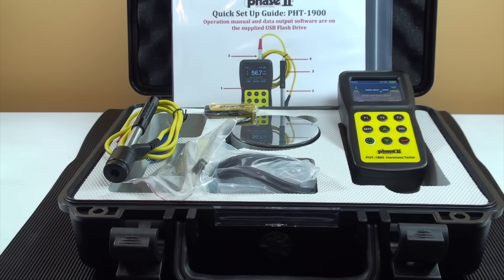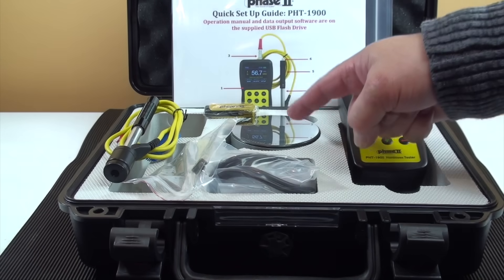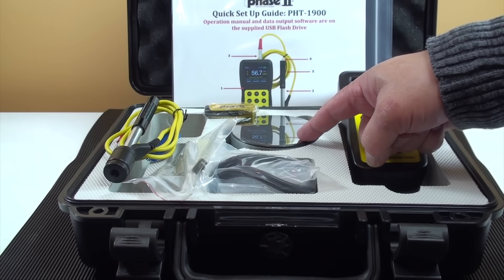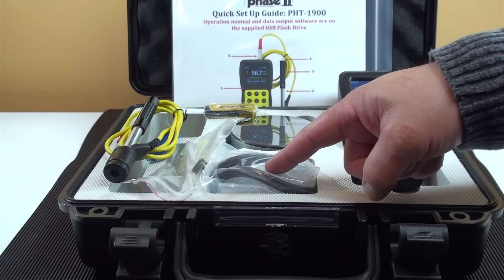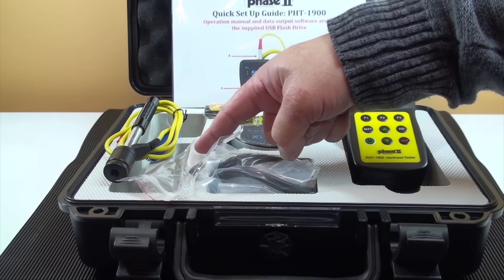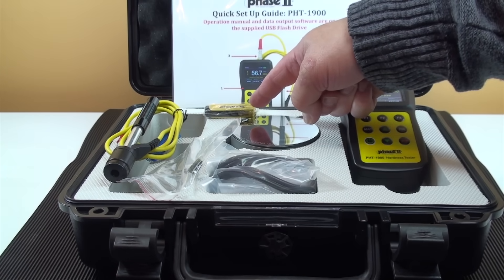Each kit comes with the tester module, a calibrated test block — note that NIST certified test blocks are available as an option — a USB cable, the impact device, a cleaning brush, and a USB stick containing software and product operation manual.